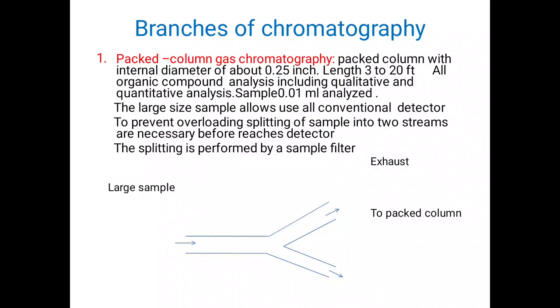The large sample size allows the use of all the conventional detectors, and to prevent overloading, splitting of the sample is carried out.